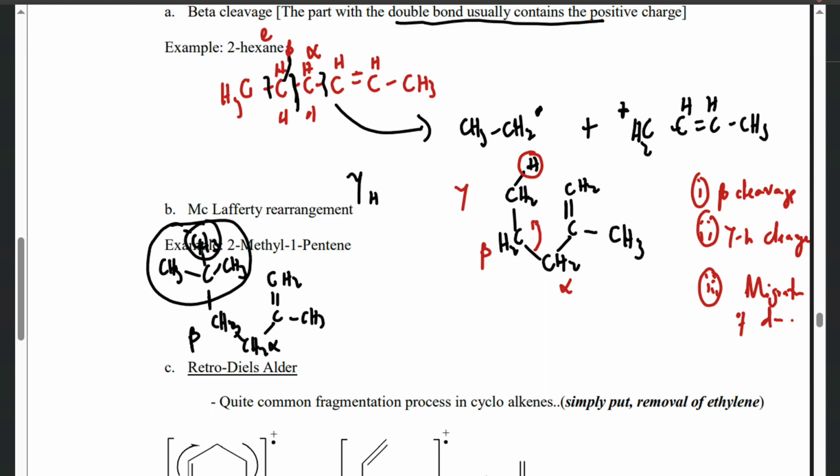So this one breaks. It's like when this one breaks, you put a dot here. Bonds like this are always recognized as a dot. This bond here is a dot. Even this one, the single bond here is a dot. This one is a dot, right? So when this one breaks, this one goes with one dot, this one goes with one dot, right? So when this one also breaks, this one goes with one dot, this one goes with one dot. So we are left with something like this. We have CH2 dot, hydrogen dot, right? So we have this one CH2 also, right?